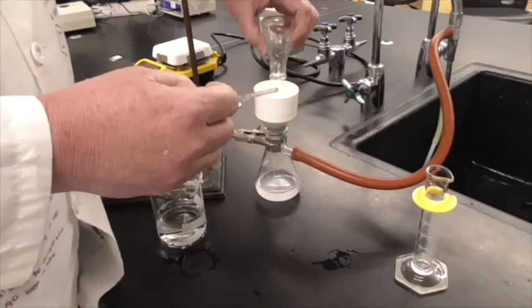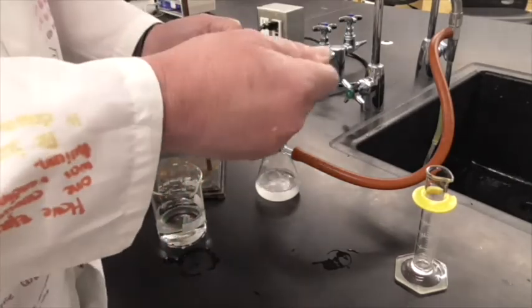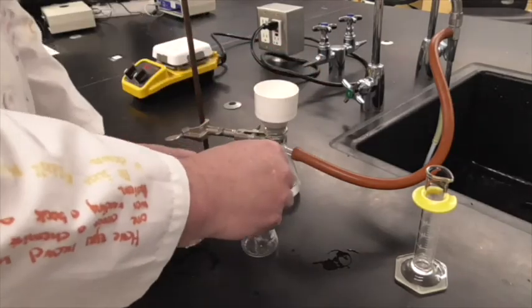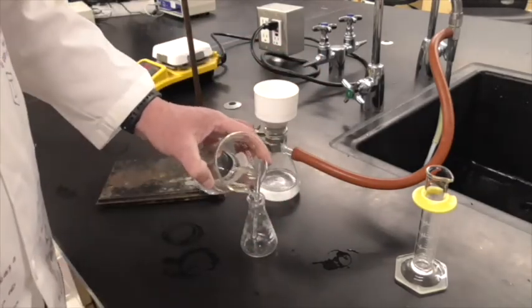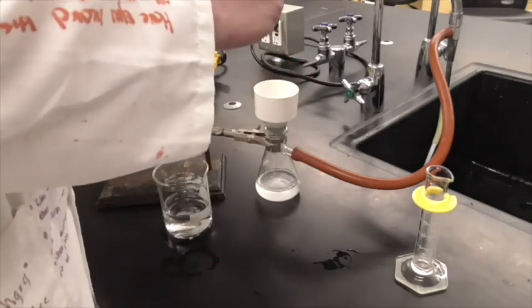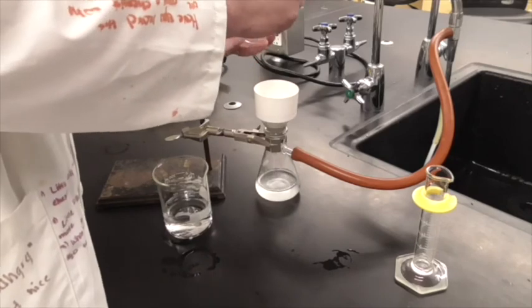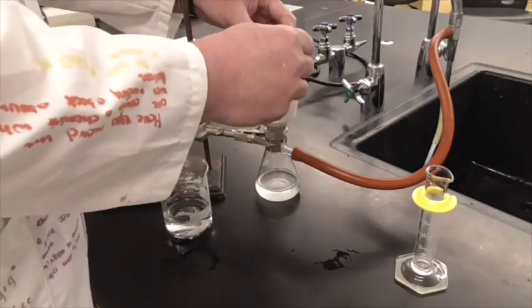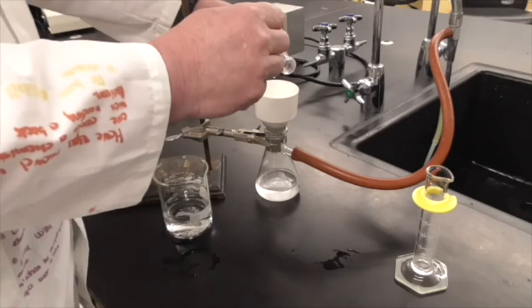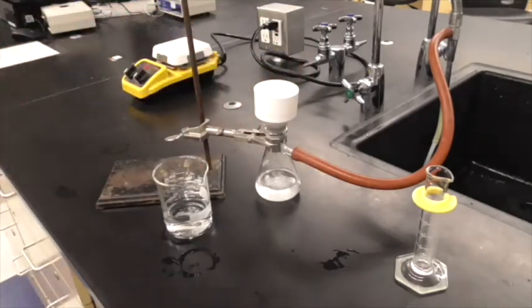See if we can get some more out, and it did. It's a little bit left, definitely some on the sides, so I'm going to add a little bit more. So we get most of that. Do that one more time here. And we're pretty good. Dump that in. The flask is pretty clear of solid. We're just going to let the vacuum work a little bit.